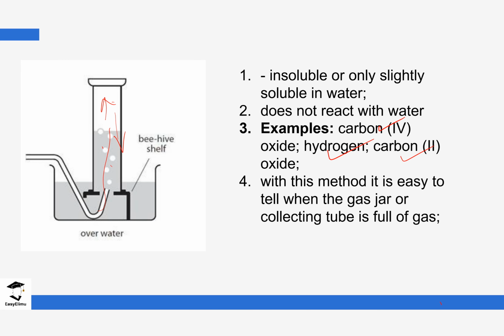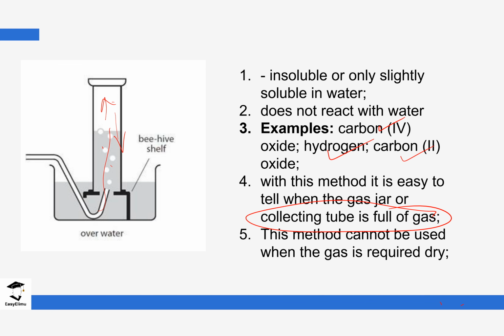And then this method is usually better in comparison to the other two methods because you can actually tell when the collecting tube is full of gas, because the water will be displaced completely. And this method is not that suitable if we want to collect our gas dry. You can see it's passing through water, so the gas that we are collecting is not dry.